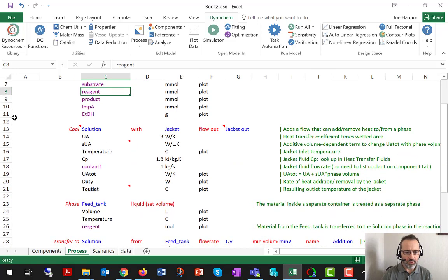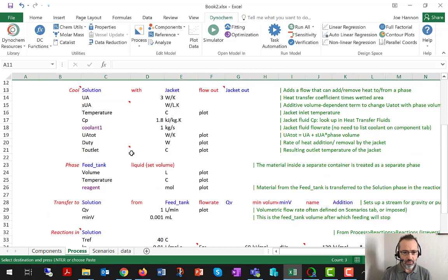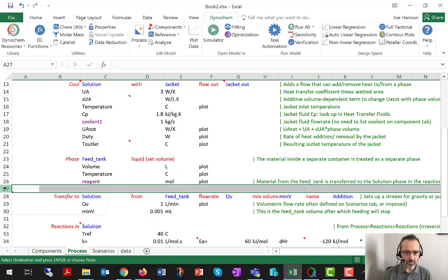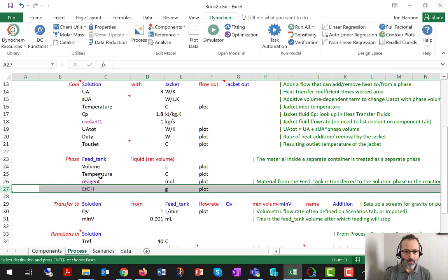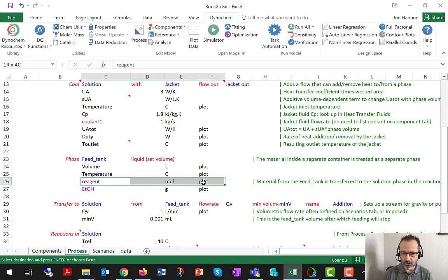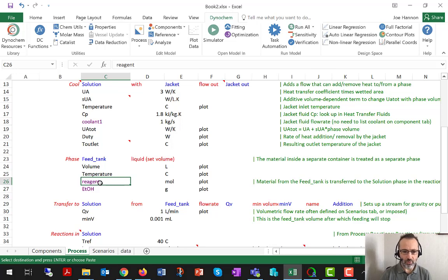I would do something similar with the ethanol line so that ethanol is listed under the feed tank. Otherwise, it might look like we're feeding neat reagent and we're not. On scenarios, we indicate how much ethanol is present, but it just makes the process tab more informative to list the ethanol there as well.